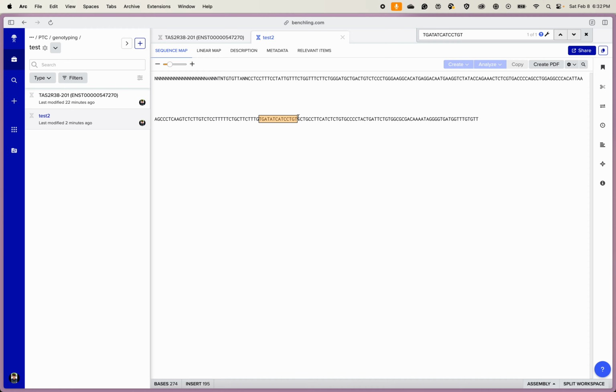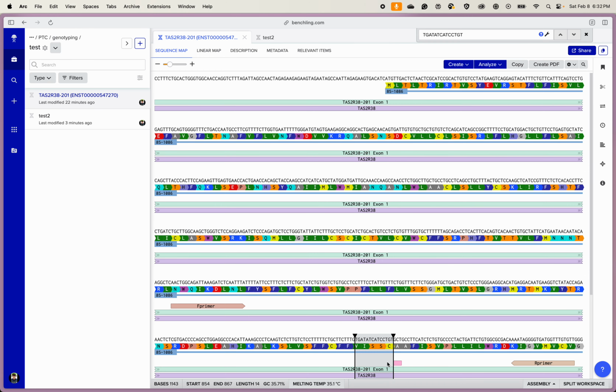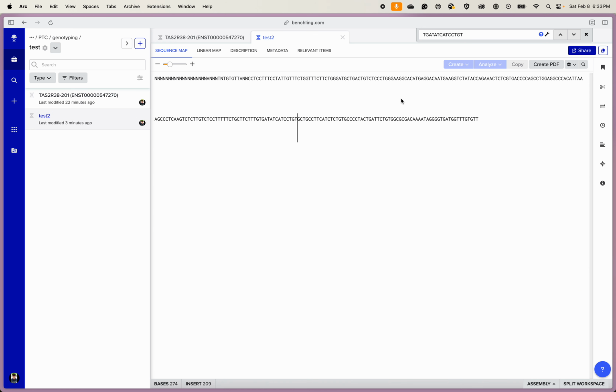There is our sequence, and right next to here, because remember, we're right next to our SNP. Oh man, I lost it, but we can find it again. Right next to here, and then you see GCT. So it's saying this person is a taster, but we have to confirm that, because they could very well be a heterozygote. So how do we do that?